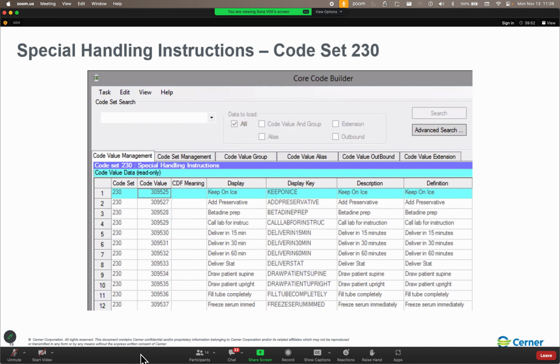So let's go ahead and do the same thing for our other row. Click on lab handling instruction, open the drop-down box, select your lab handling instruction, click save, and then that's it. We are done in colrecmate for now. So does anybody have any questions before we close out of this application? All right. So exit that application.